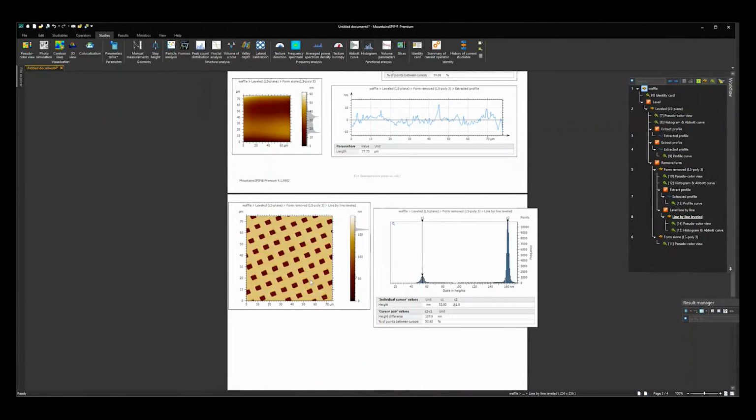So flattening and plane fitting are ubiquitous for AFM analysis. Plane fitting, the larger the scan size, the more likely you are going to have to plane fit. And flattening, pretty much every image you're probably going to need to flatten to adjust for the raster scanning artifacts. Again, lower order is better, but these are really useful tools and ones that will be needed.